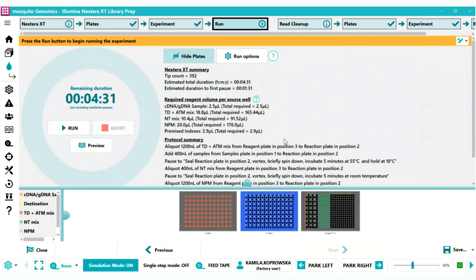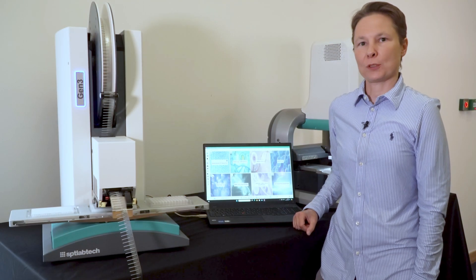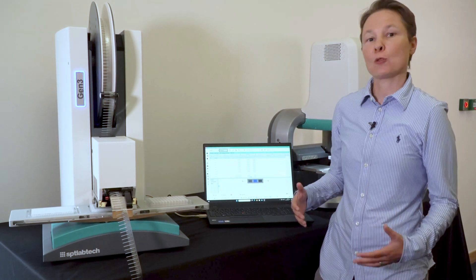Once you place your plates with samples and reagents on the Mosquito deck, just hit run. You will be prompted with further instructions once it finishes. Mosquito GenFree is not limited to predefined experiments. In protocol mode, you have the freedom to design the experiment exactly how you need to run it, or to develop a new method or assay.